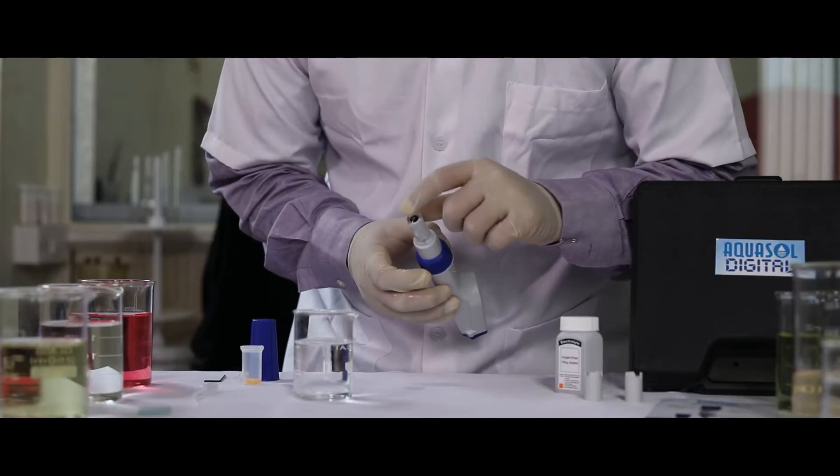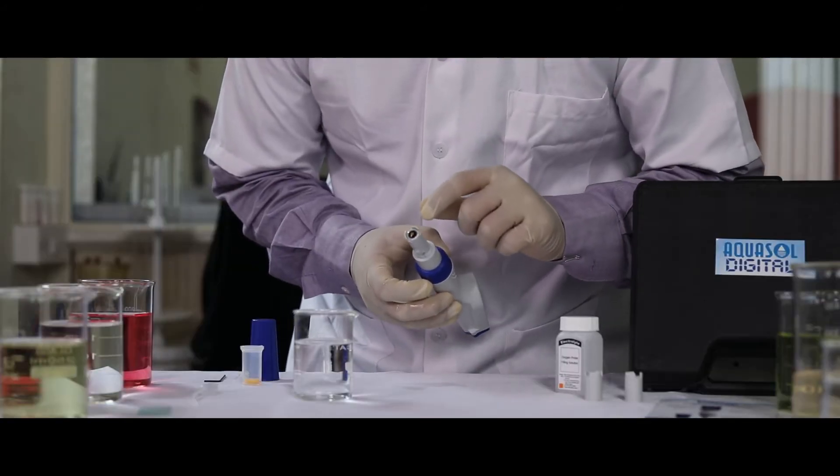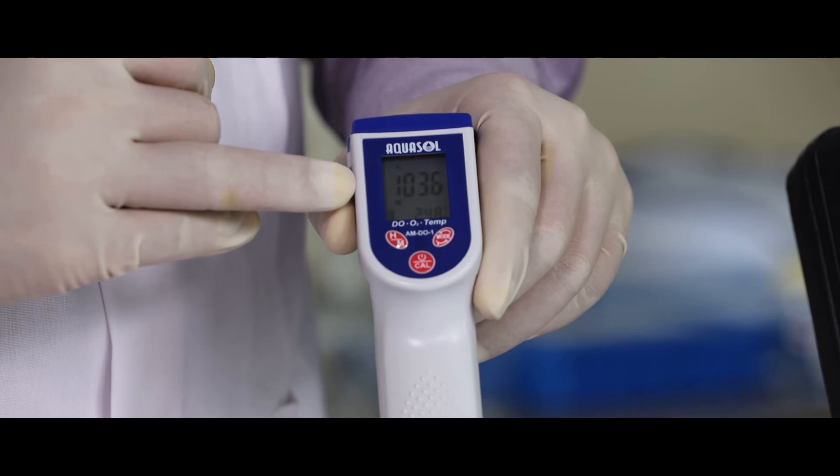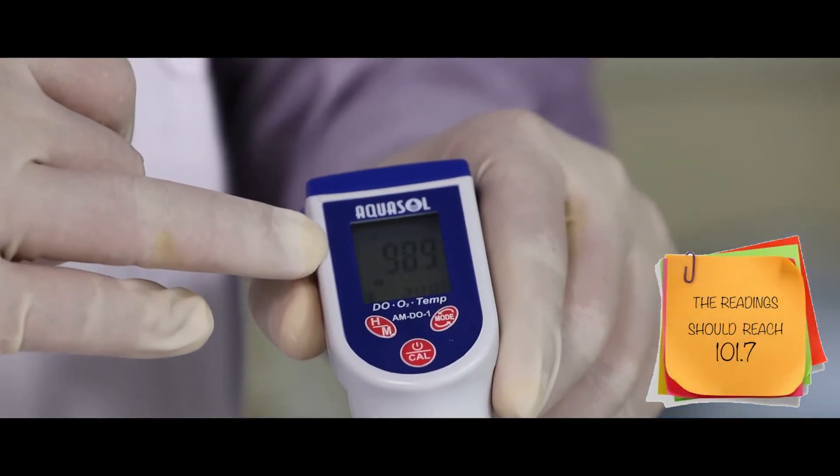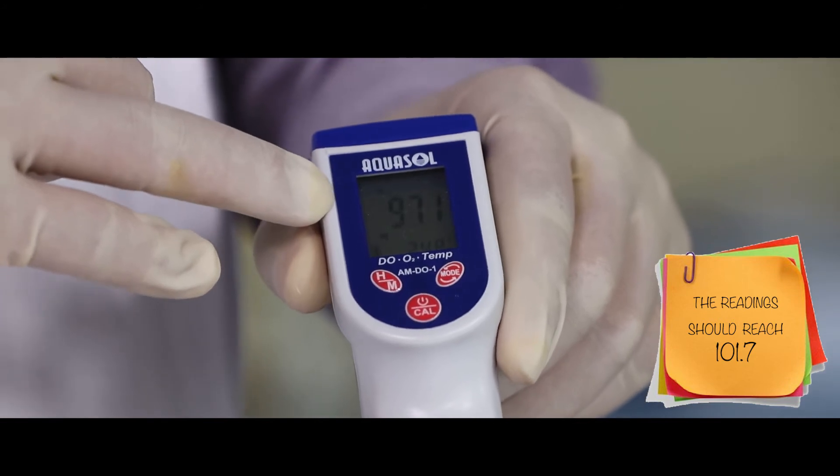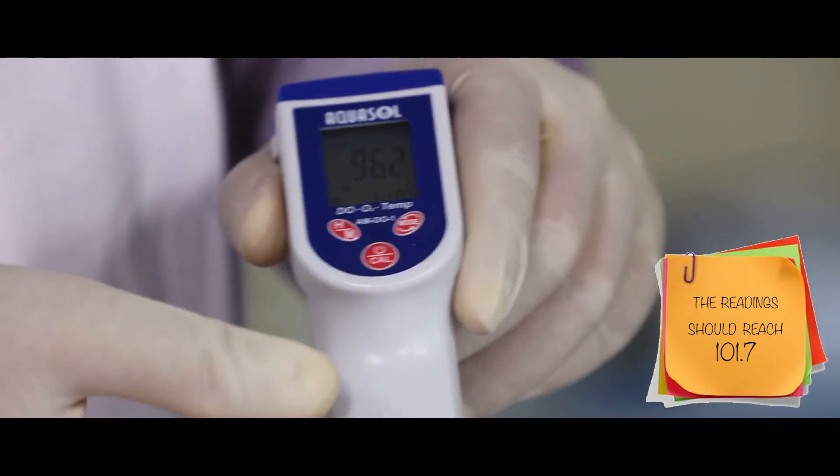Make sure no air bubbles form. Now turn on the meter. The meter will take about 20 to 30 minutes to polarize. The reading should reach 101.7.